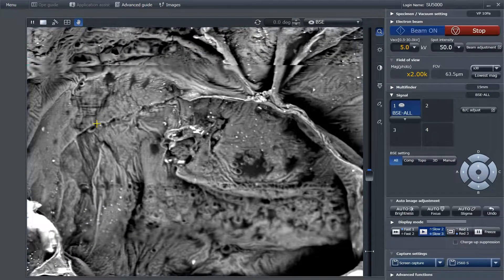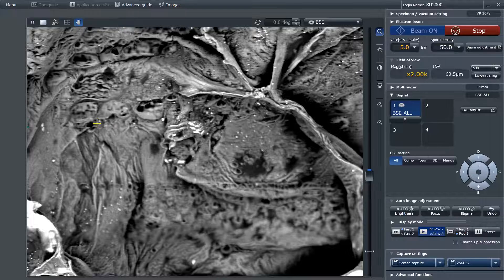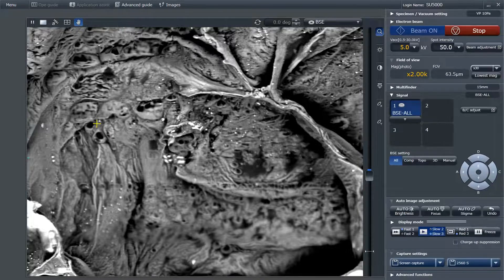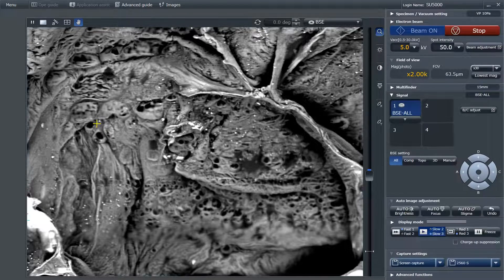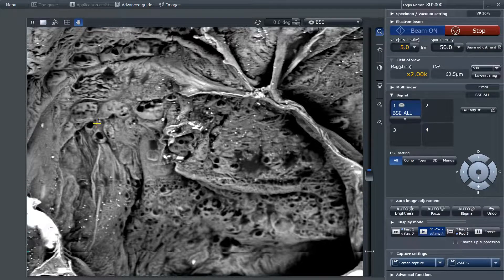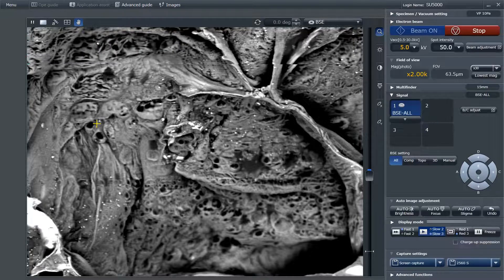And even more evident here, you can actually begin to see them rise out of the surface of the carrot.